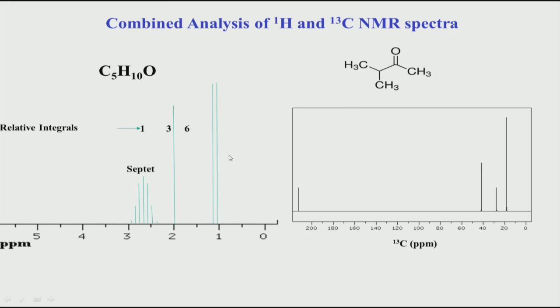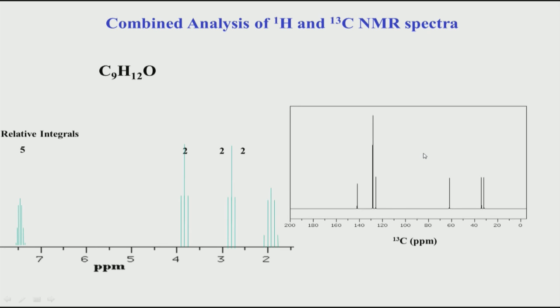So, right now we are looking at this spectrum in isolation, means separately, but a combination of these two would also give me the information as to which carbon peak here matches which carbon proton here. Okay. So, that information is not in this, because we are looking at separate 1D. So, let us come back to this particular case.